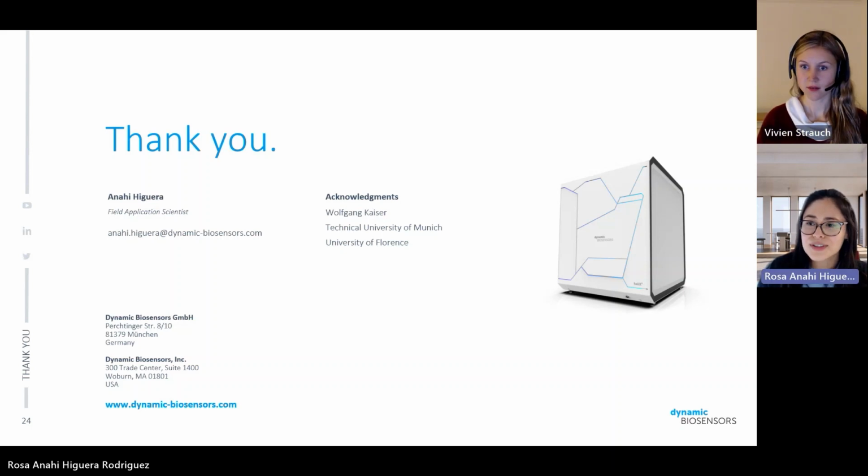I think I forgot to answer one part of a question related to measuring versus some other techniques. Some customers have comparisons between our technique and others like BLI and SPR. Normally we are in accordance with those techniques. Sometimes we are a little bit off, but the trends are always very comparable, especially with technologies that are very similar to us, like SPR. We normally have very comparable values.